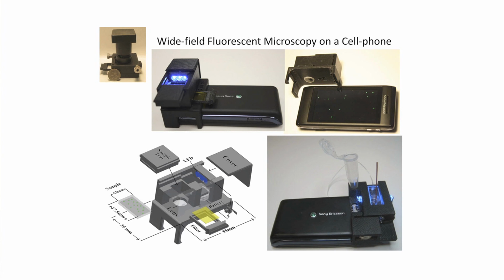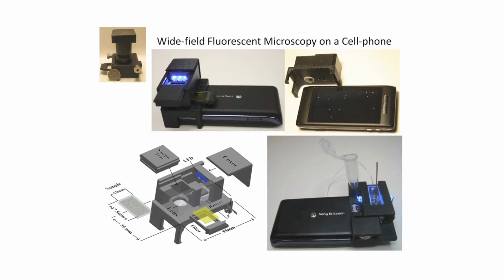The sample, which might contain, let's say, a water sample or a blood sample that you've labeled certain things in, and you want to count what is fluorescing, that's going to tell you some number, whether you shouldn't drink that water or not, or whether your blood cell count is too low or too high. That sample itself, which is disposable from our point of view, is also acting like a waveguide. It actually collects the excitation light, which is delivered by these LEDs. These blue LEDs are providing the excitation. But the excitation is guided within the microfluidic device.